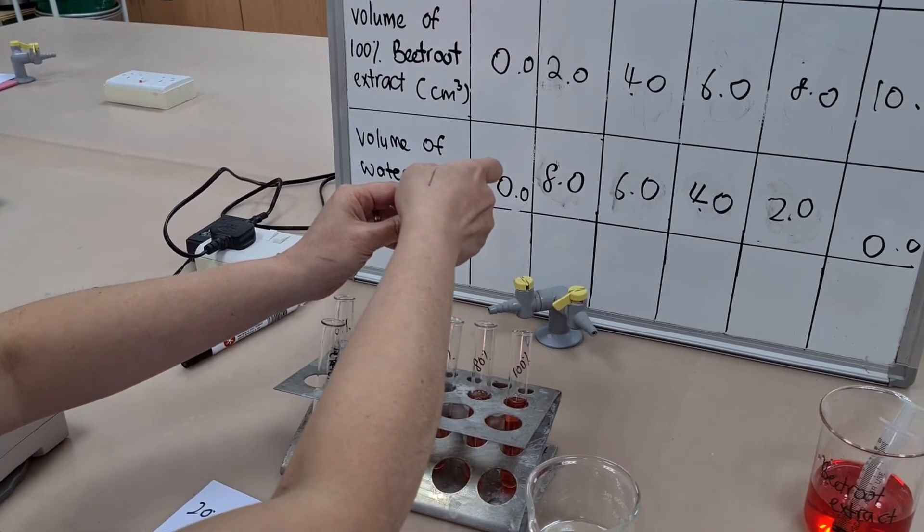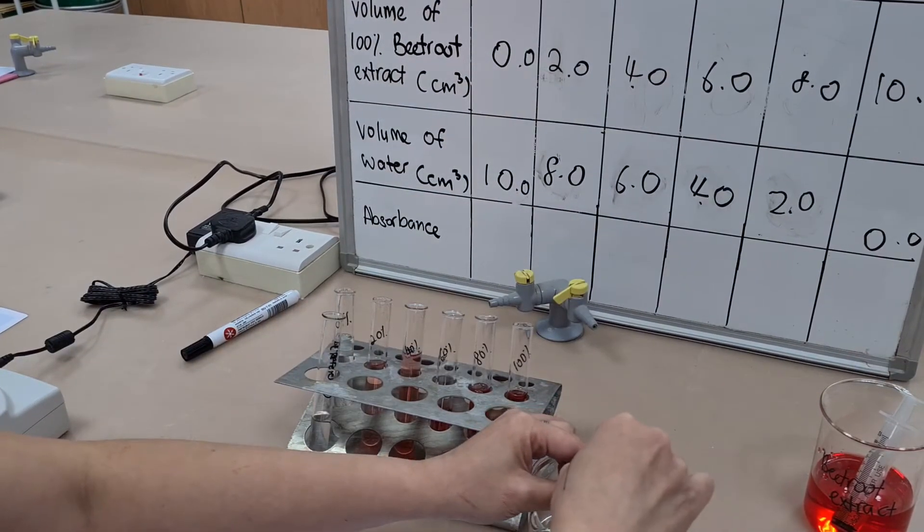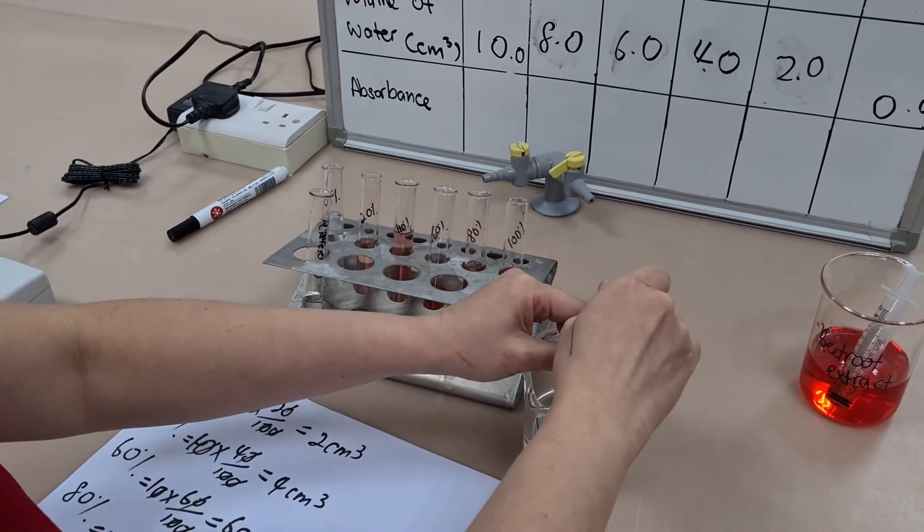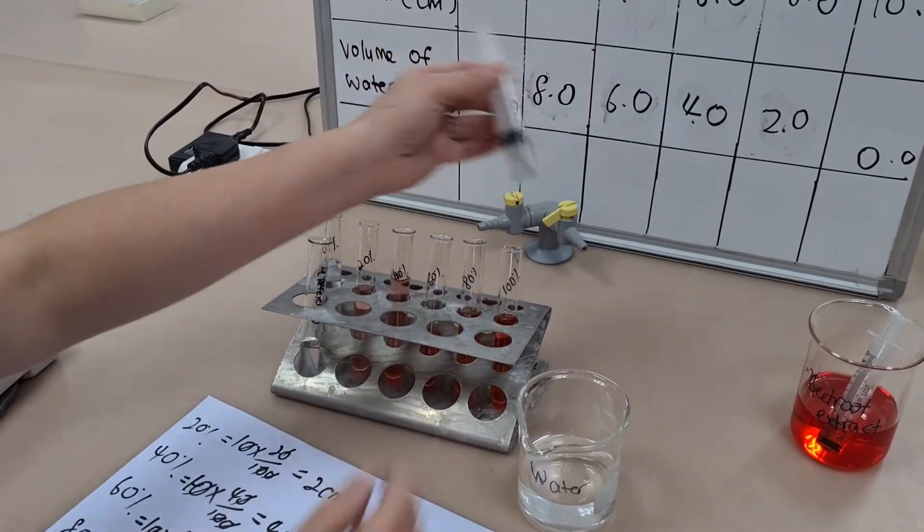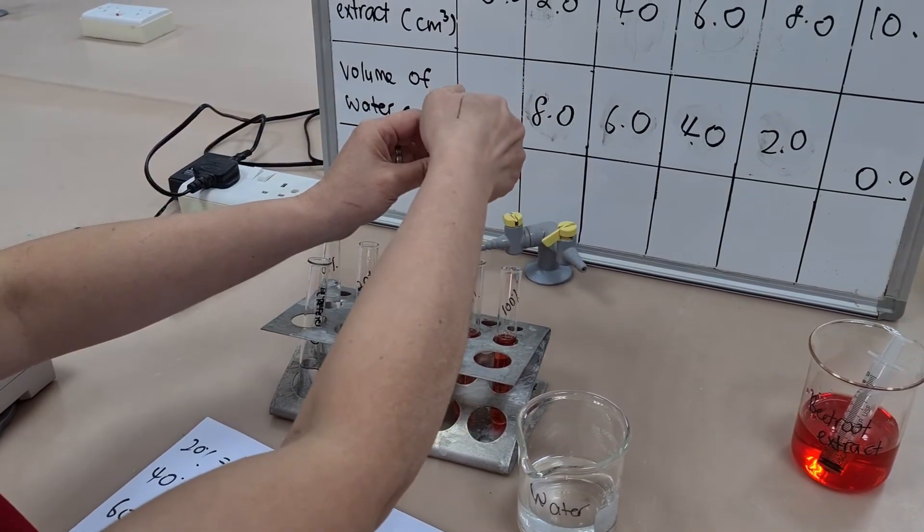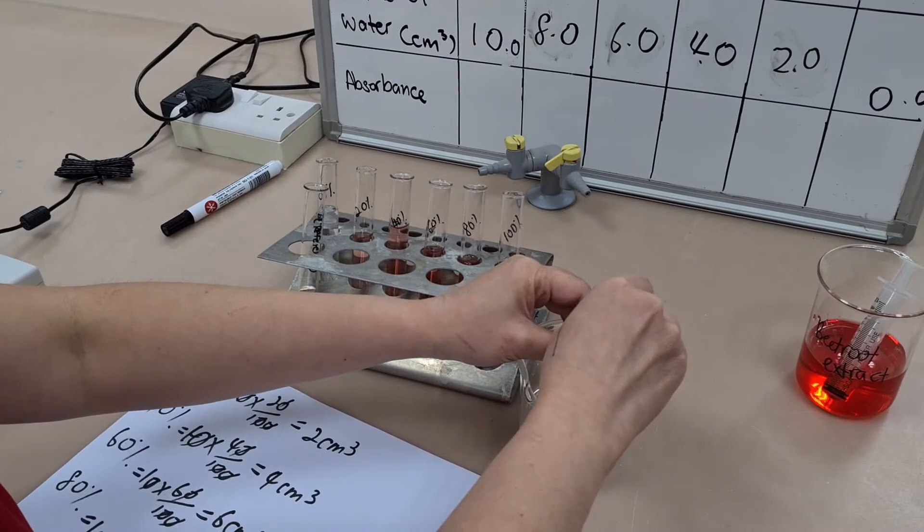The same technique is used here as we've seen before. We use one syringe and we fill all of our test tubes with water first before switching to the other syringe and filling them with the beetroot extract. All test tubes are clearly labeled.